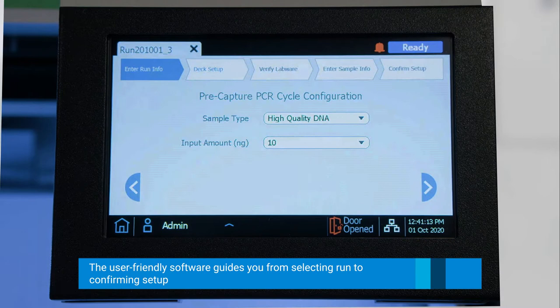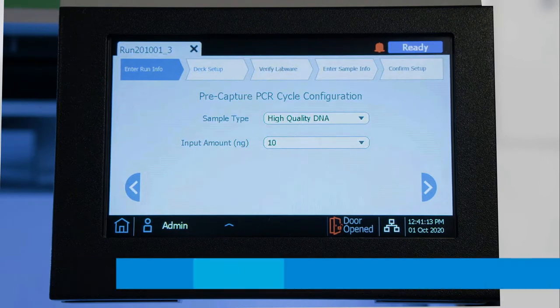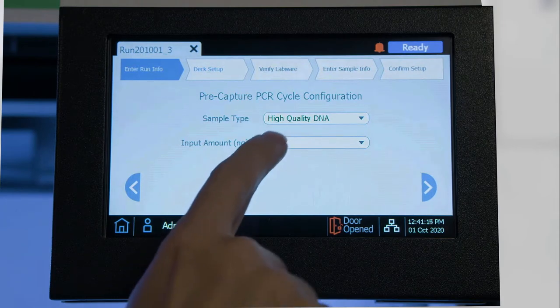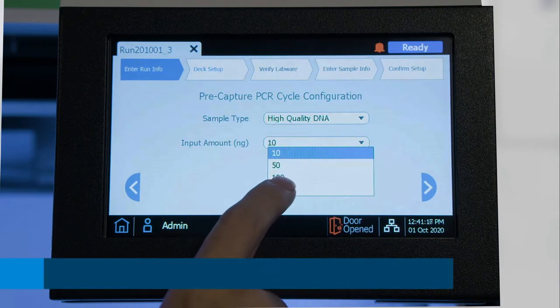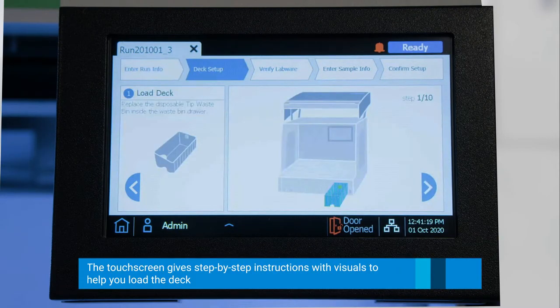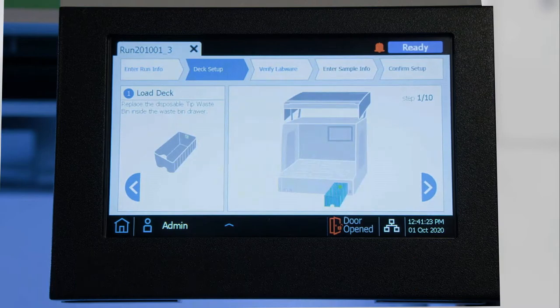On this screen, we will select whether we have high quality or FFPE DNA, as well as the input amount. For today, we will choose high quality as well as 200 nanograms of input. Click Next, and now we are going to start setting up the deck.